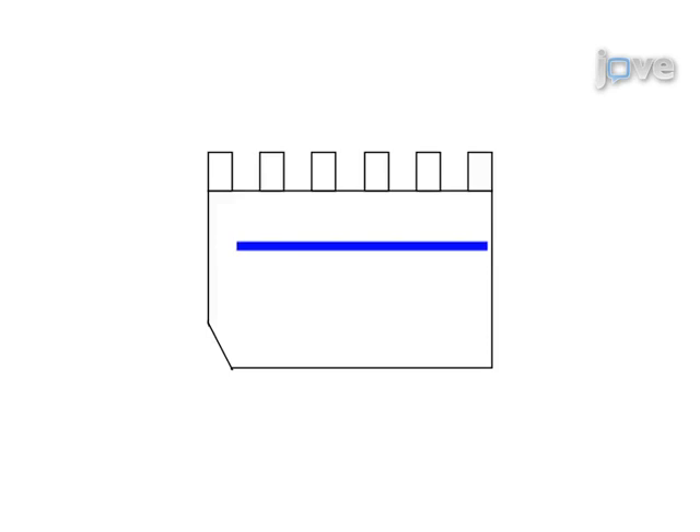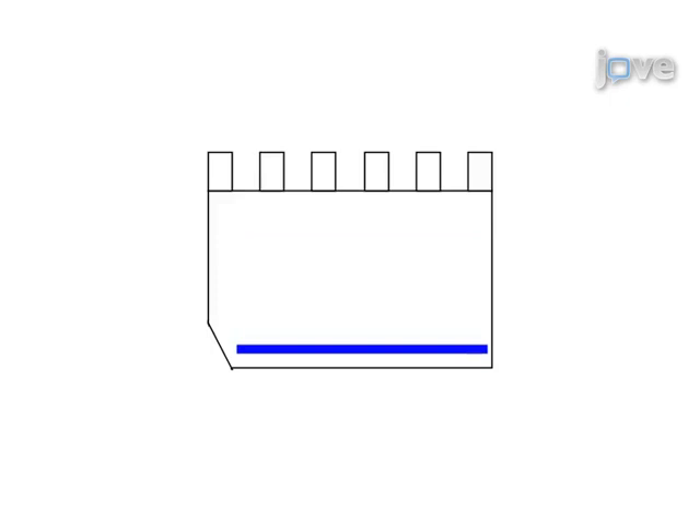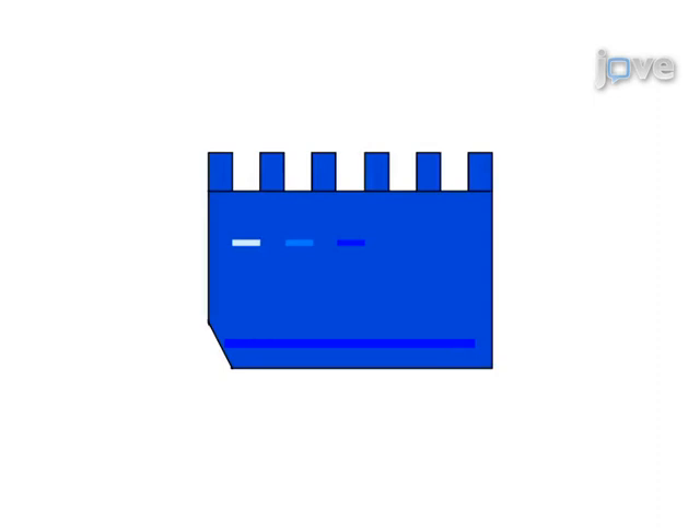A gelatin zymogram gel is then loaded with the sample and allowed to run until the tracking dye reaches the end of the gel. Following electrophoresis, the gel is re-natured, developed, stained, and de-stained. The final step of the procedure is to scan the gel for data analysis.